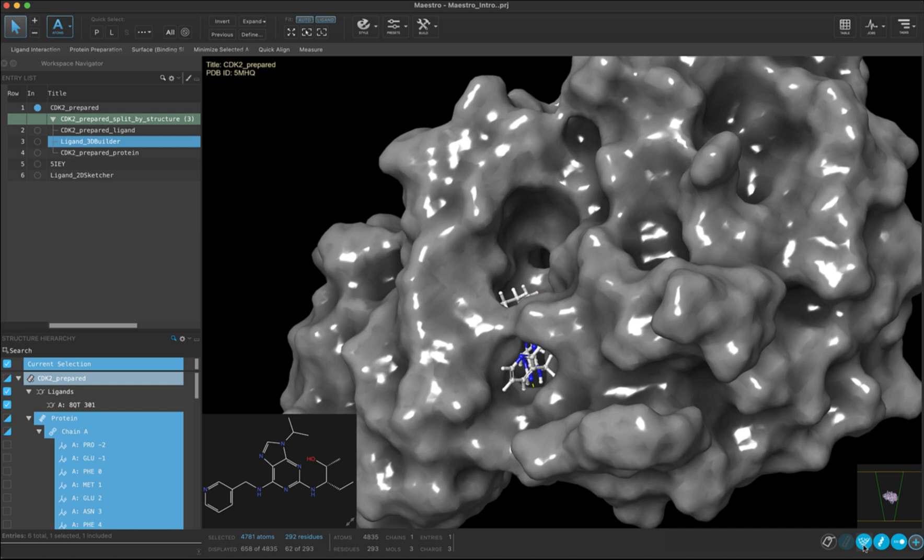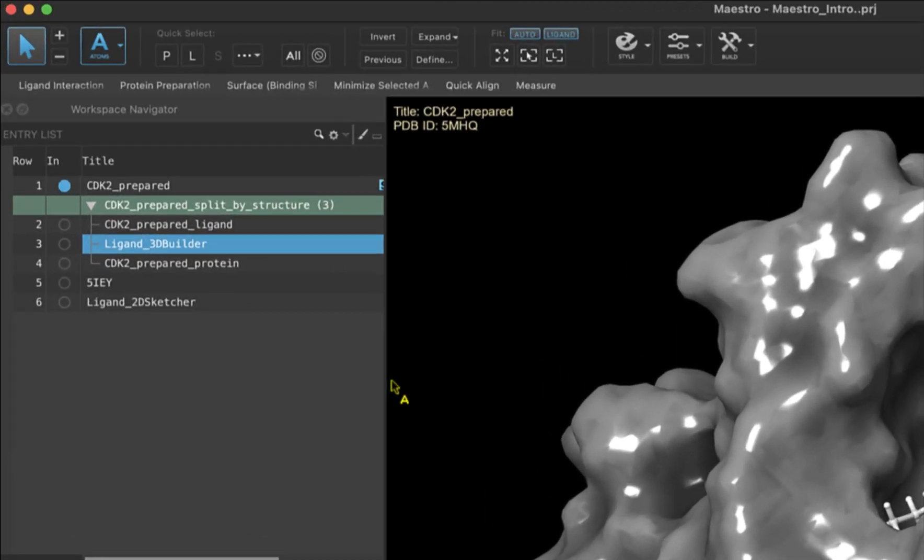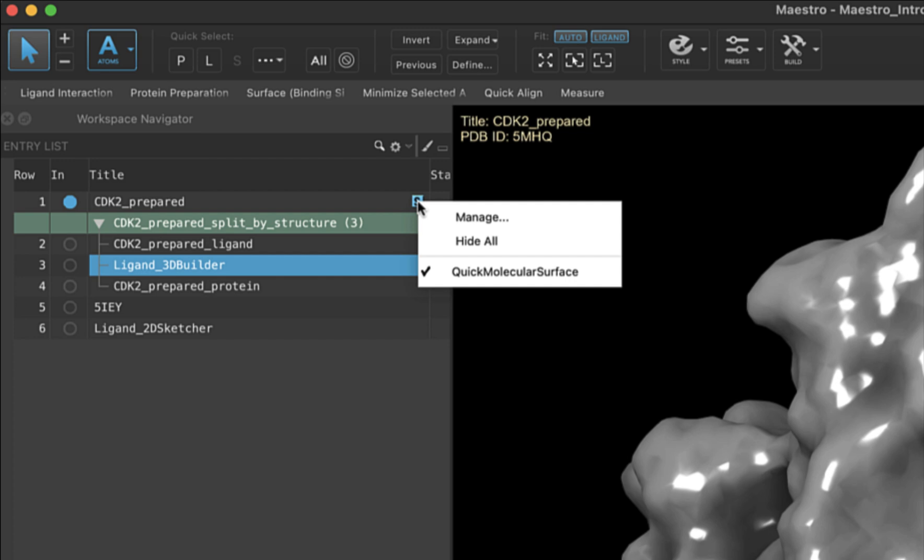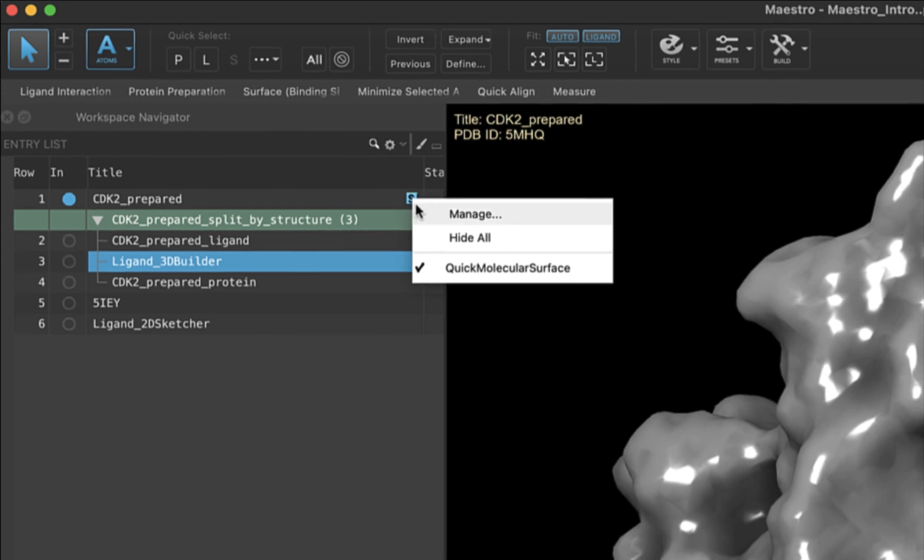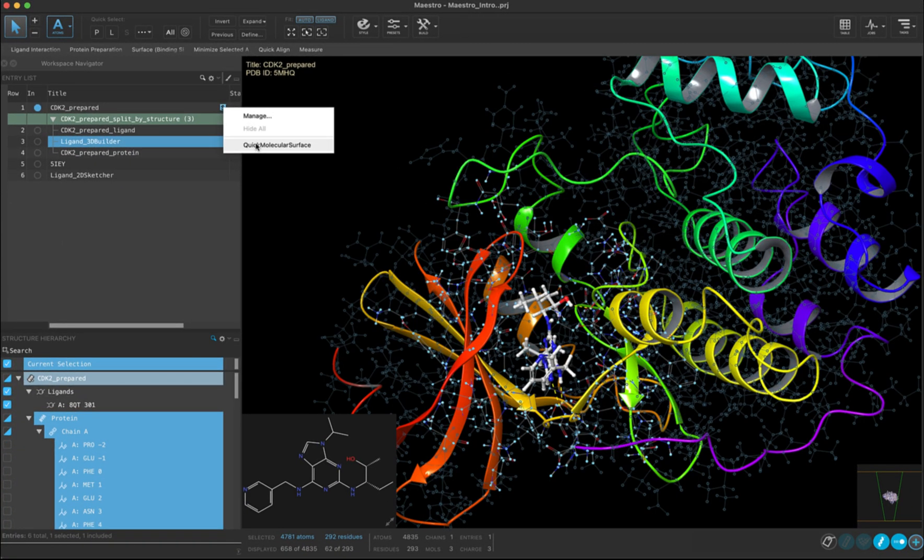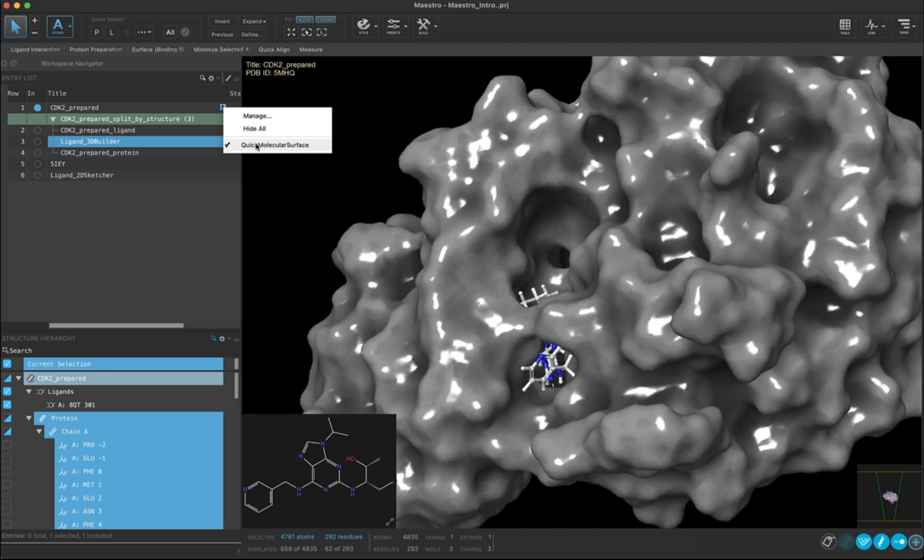The third way that we know a surface is present in our workspace is that if we look at the entry list, there is an S next to the entry in which the surface was added. If we click on that, a few other options come up. You can click on the quick molecular surface to uncheck it, and the surface will no longer be displayed. You can click to check it again, and the surface will once again become visible. You can also manage the surface and change how you view the surface in the workspace.